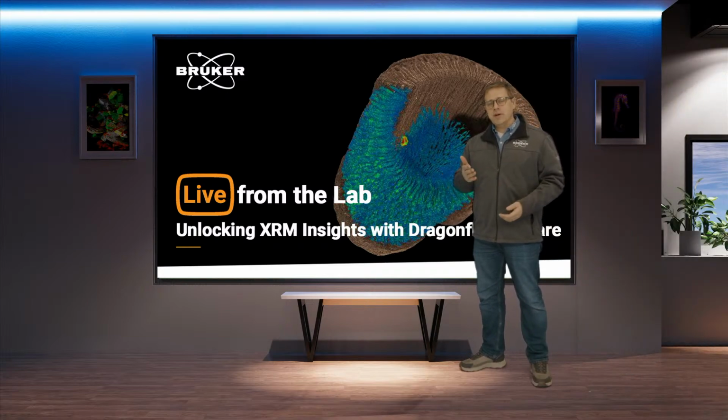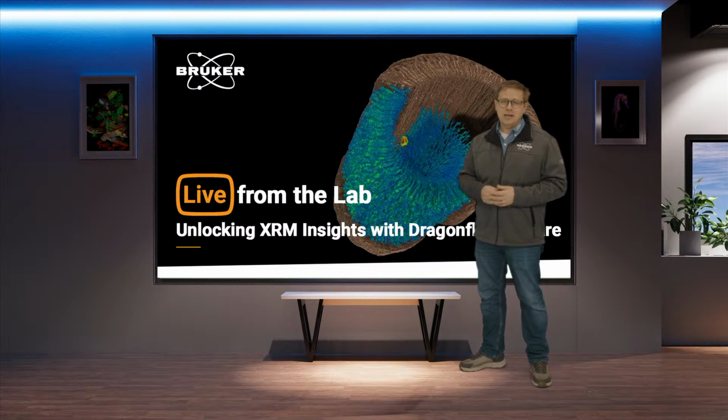This is the show where we talk about different technology that Bruker has developed in order to help scientists understand the world around us. Today's technology is going to be XRM. XRM, or X-ray microscopy, is a combination of micro-CT scanning with specialized software. And that software is really key to getting out the results and the meaning from those digital twins that we create. Just to give you a quick summary, and if you're interested, we do have other Live from the Lab episodes on this that go into more depth on the technique.